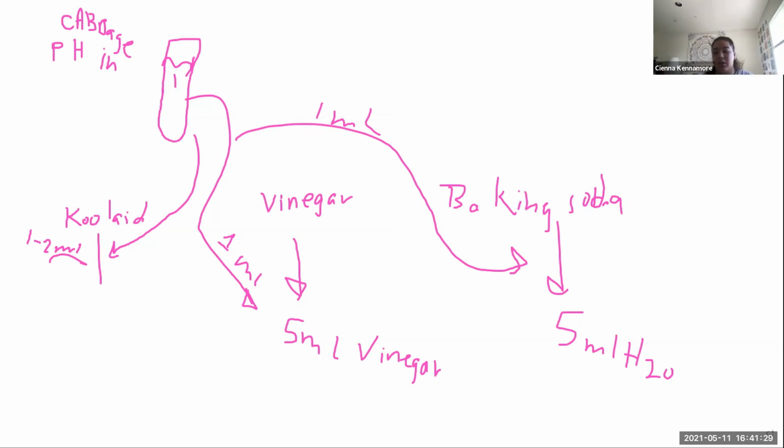And then vinegar, the strip, I threw it away. It was literally the same color as 14, but I know that's wrong because vinegar is not alkaline. But the color of it when I did the cabbage is like a 2. So I don't know that my strips are very accurate. Yeah. Okay. Well, just record what you have, and then do you have any more of your strips left? Yeah, I have a bunch. Okay. So just test it again.